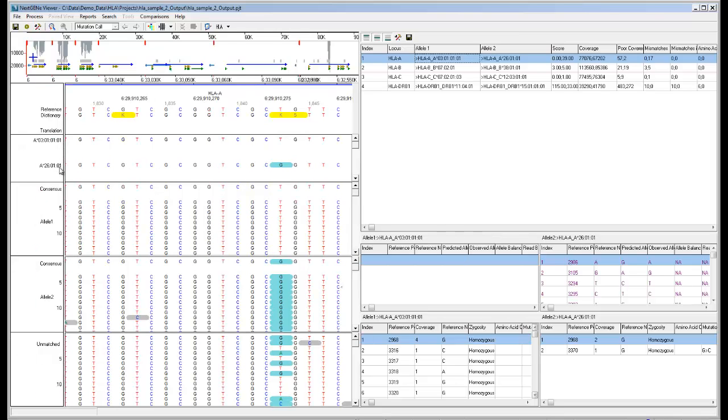The next two panes are the consensus sequence panes, which show the consensus sequence for the sample data at the top, along with the aligned reads for the selected allele pair.